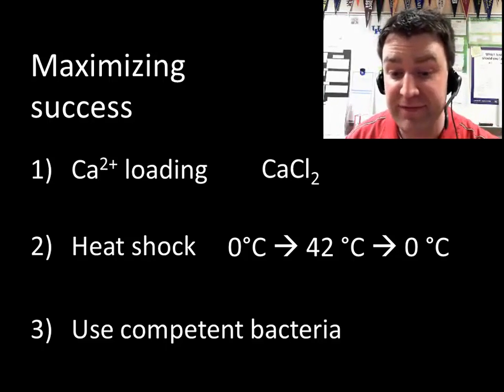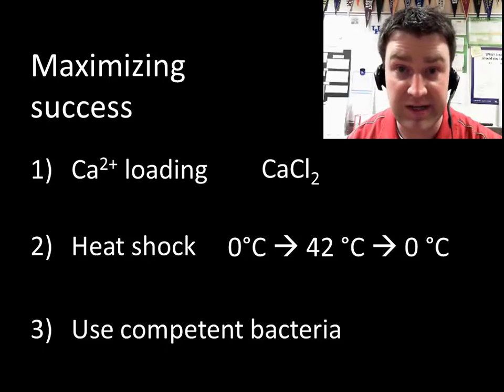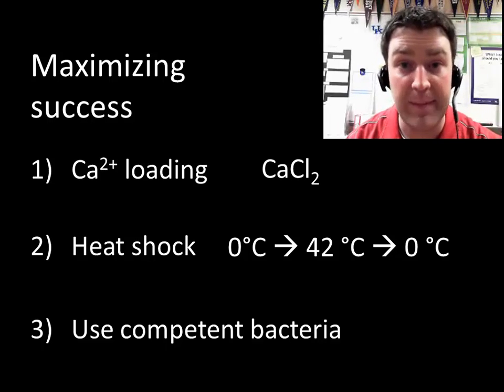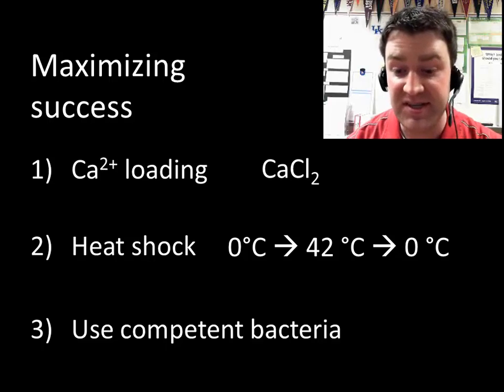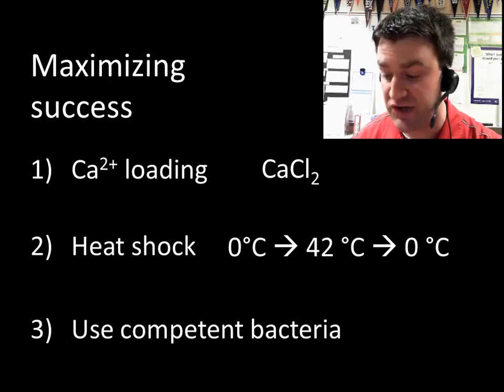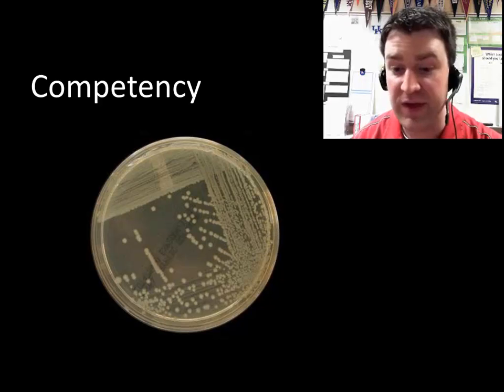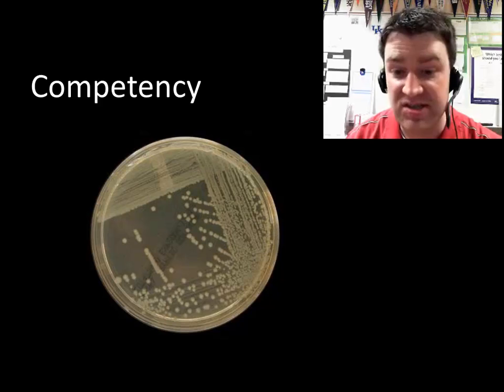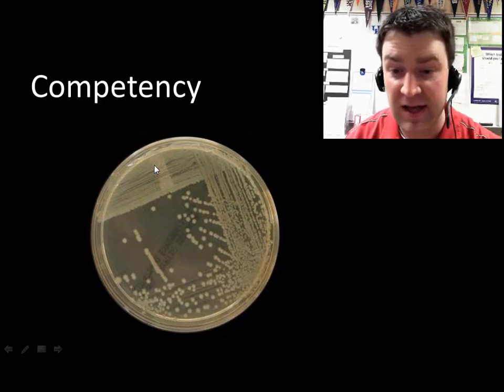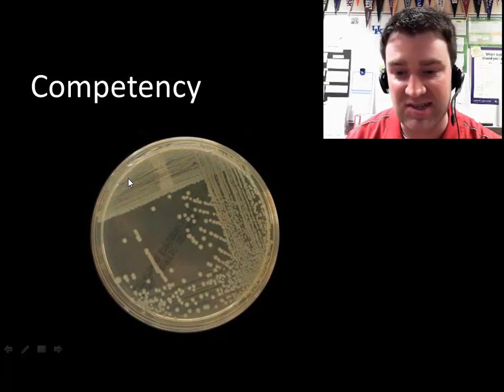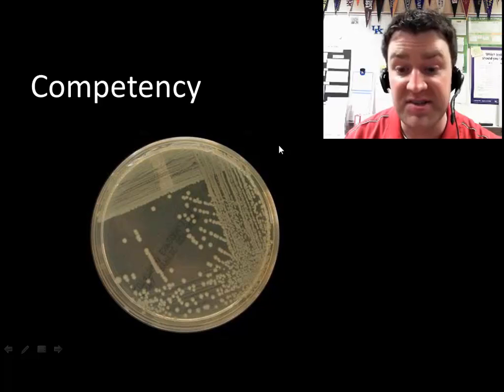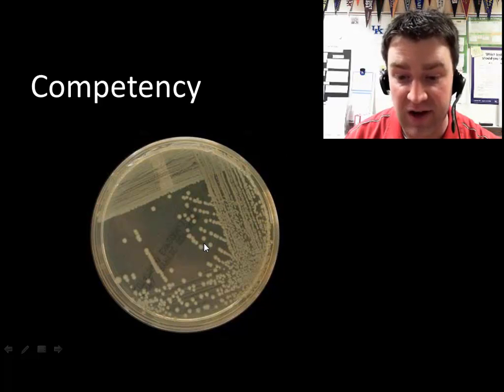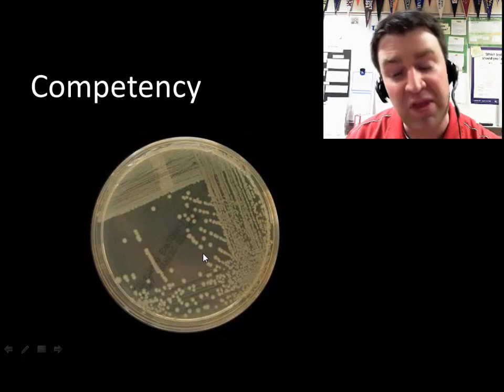So heat shock and then finally we want to use the right kind of bacteria. So we call this competency. Competency here refers to how often you might transform. And if you get a starter plate that looks like this when you come into lab the temptation is to use the bacteria up here because there's just so much more of this white. So you figure the more bacteria at least I'll be successful with some of them.